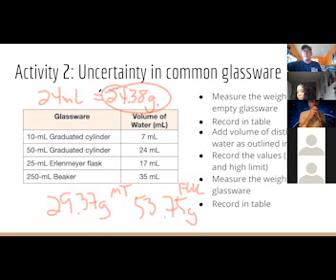That's all well and good, but with the flask, you don't have nearly as many measurements to go off of. There's only two. And basically all you know is that it's going to be about halfway in between them. So you may be able to get fairly close with that. Not nearly as accurate as Arissa pointed out if you use the graduated cylinder.